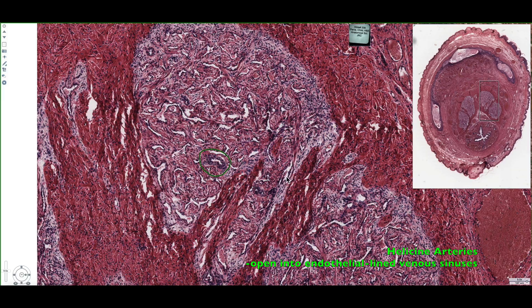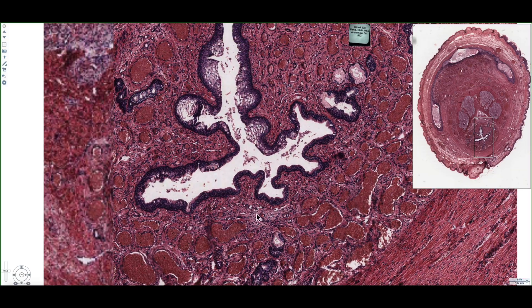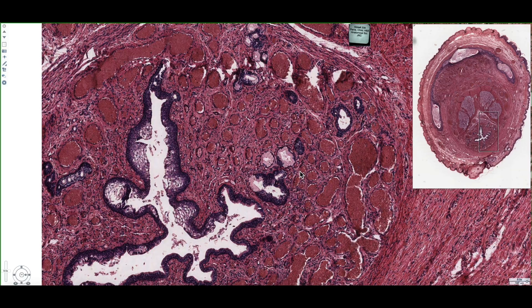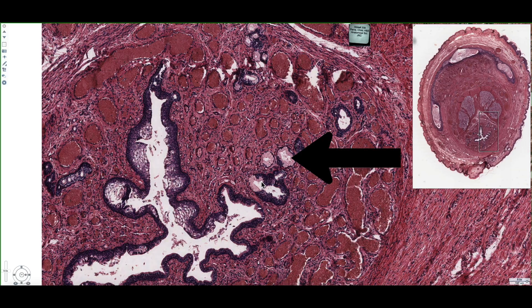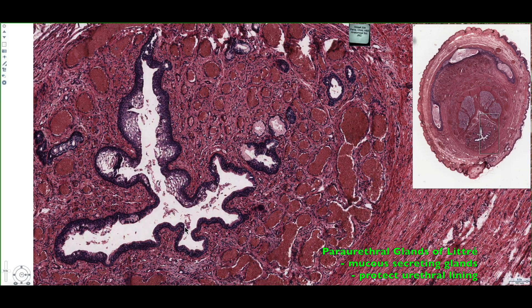Looking at the corpus spongiosum, we can examine the special features of the penile urethra. The urethra is lined by a pseudostratified columnar epithelium, and we're going to have secretions from a special gland called the paraurethral gland of Littré, which we can see outlined in the submucosal region. These pale-stained cytoplasms are our paraurethral glands of Littré, and they help secrete mucus to protect the pseudostratified columnar epithelium from the flow of urine passing through the penile urethra.